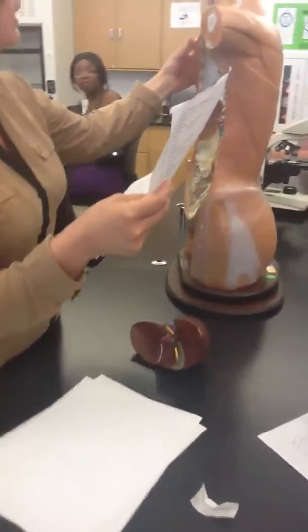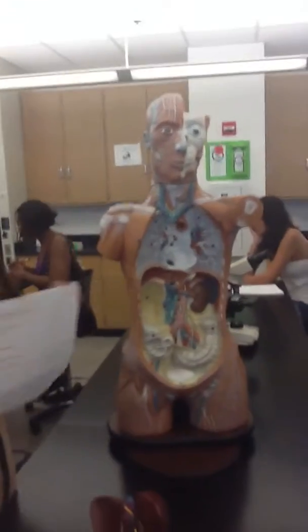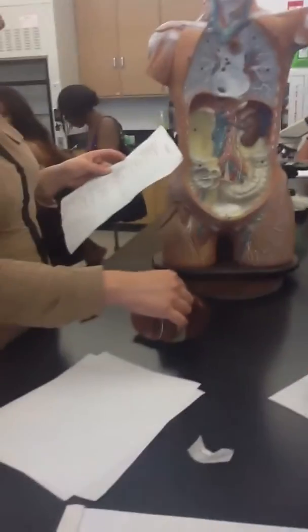23, we have the bile duct, and 24 is the gallbladder. Here in 25 we have the parotid gland. Is it cystic duct or bile? No, it's the bile duct. It's not the same. 23 again for you is the common bile duct or bile duct. You can put it like that, okay? And 24 is the gallbladder.